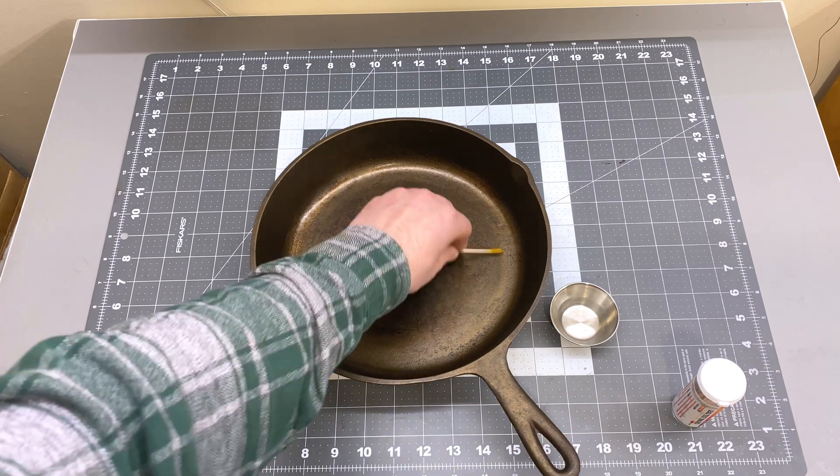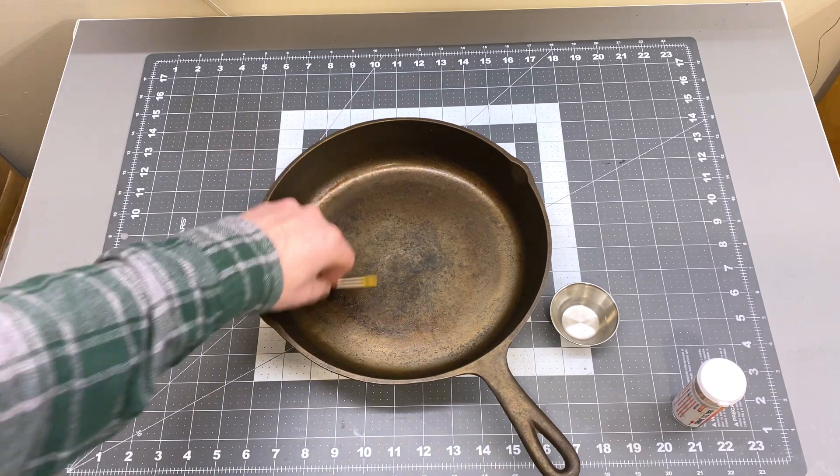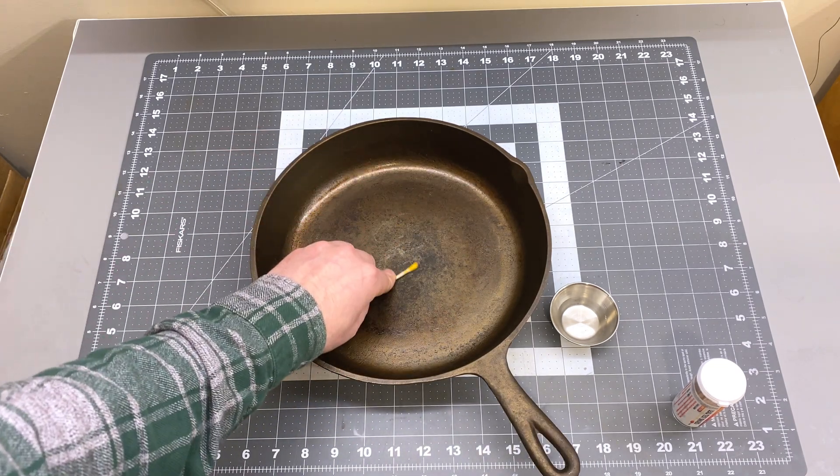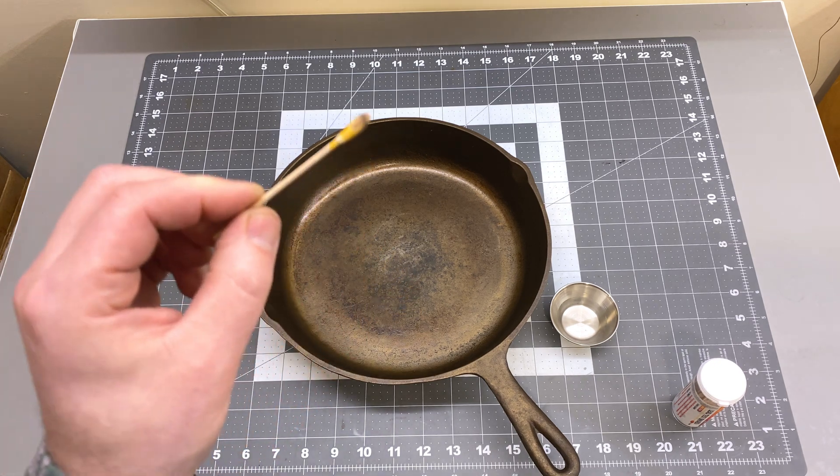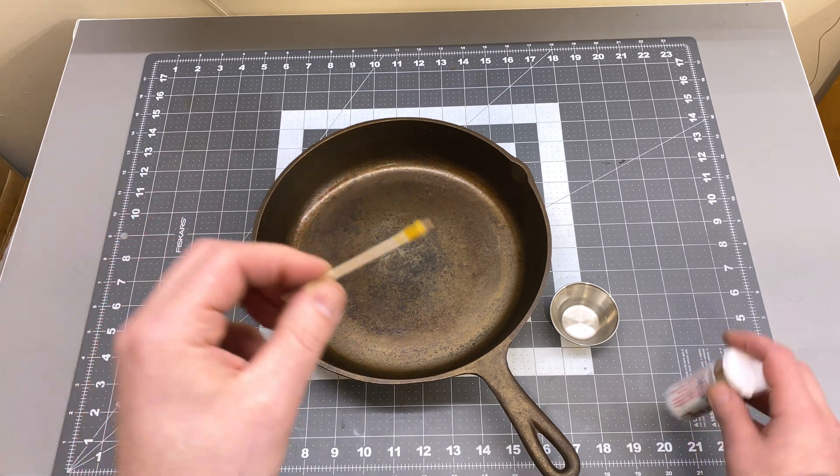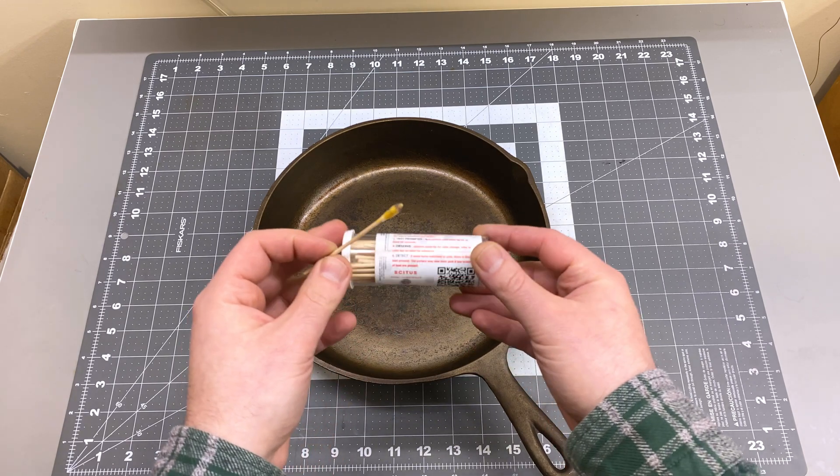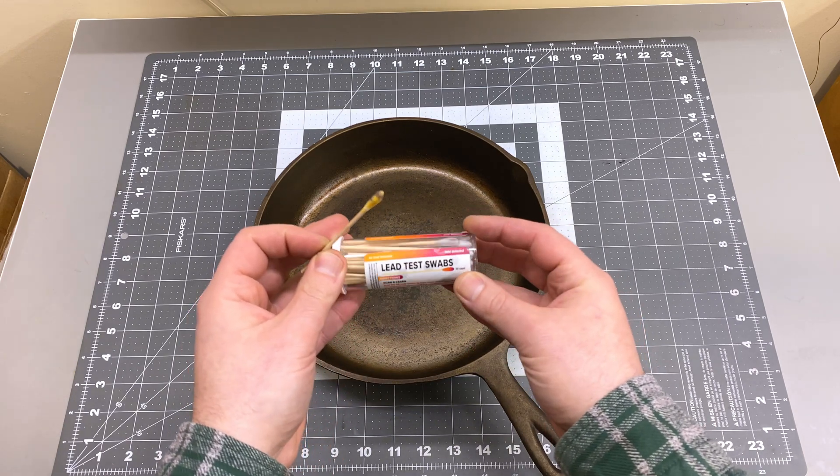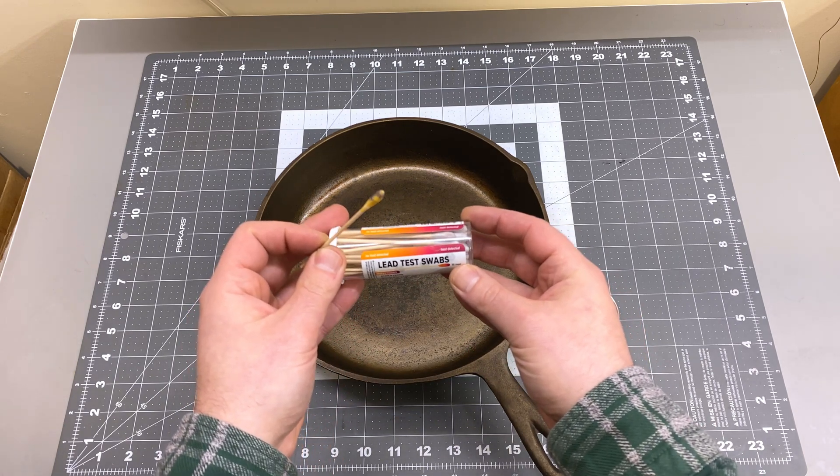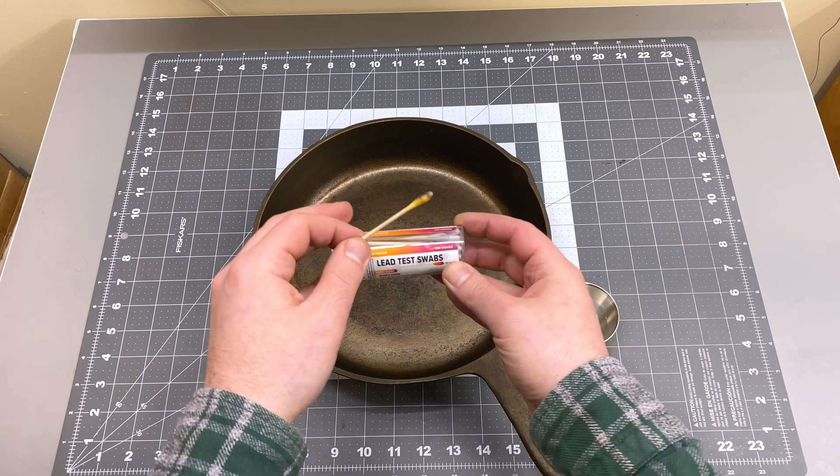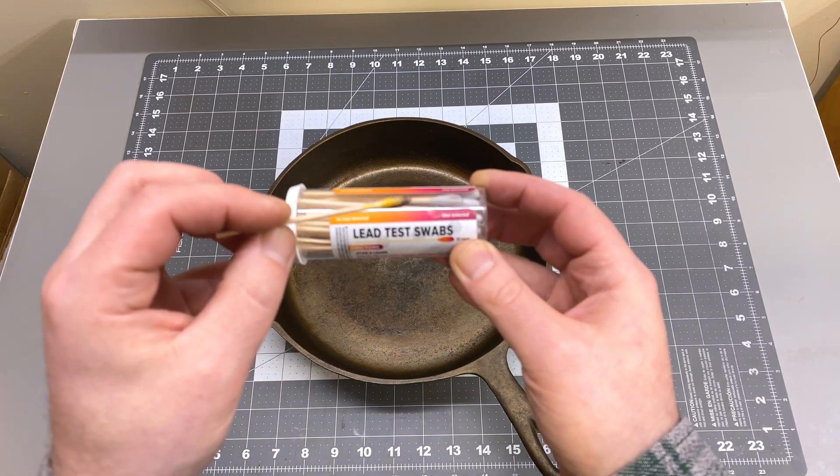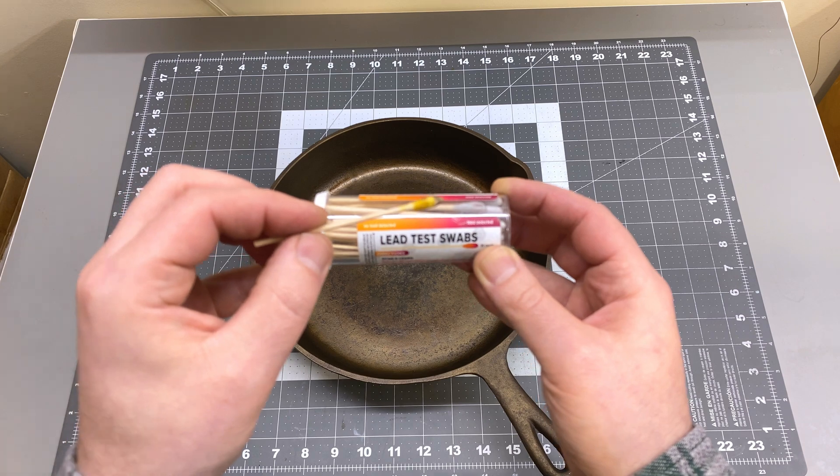So the instructions say to swab the pan or surface for 30 seconds and then to see. And I don't see, though it's a little out of focus, I don't see any change in color other than just wiping off some built up carbon on the pan. So that seems like a negative test result.